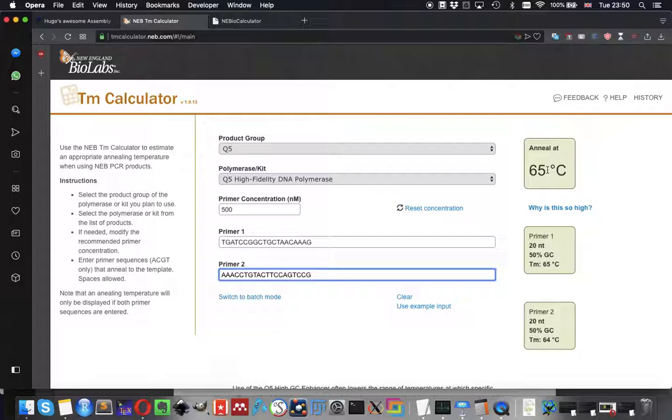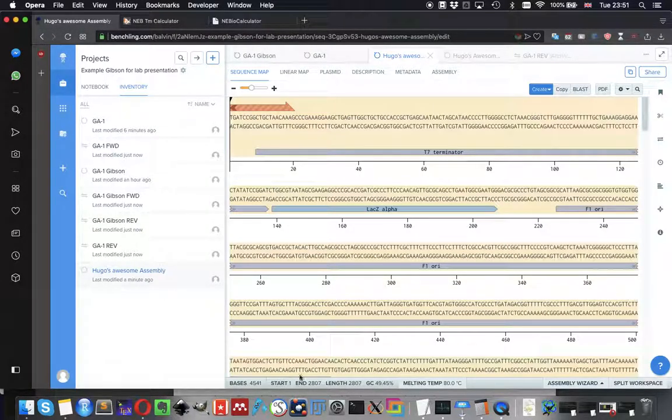At the beginning, denature at 98 degrees for 10 seconds. The melt, whatever it's called, I forgot now. Anyways, that's more or less the cycle, and it should give you 2,807 base pairs.